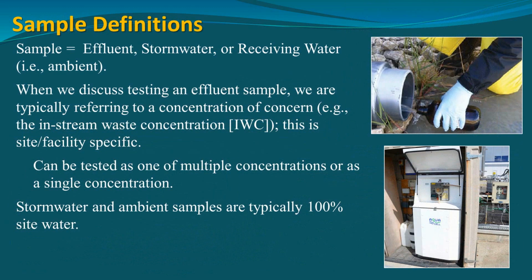So throughout today and tomorrow, I'll talk about samples. And when I'm referring to a sample, it can mean effluent, stormwater or receiving water, and it's just whatever it was that we collected. So it's not always going to be an effluent, even though the titles of a lot of these documents have whole effluent toxicity in them. They're used for a variety of applications, and so I'm trying to get away from just calling something an effluent every single time.